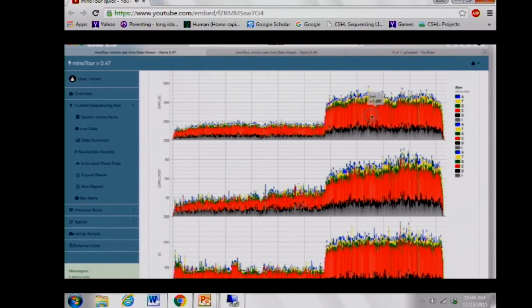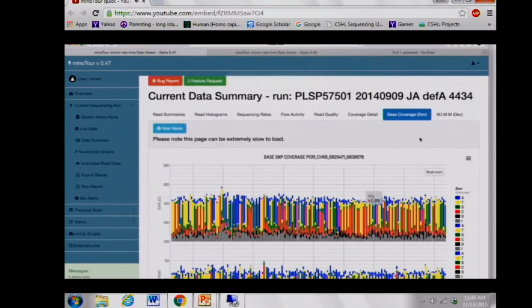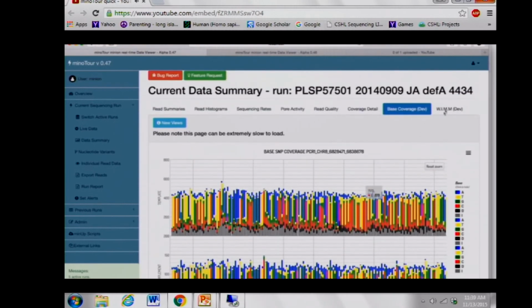I'm just going to zoom in on a tiny fraction of this so we can see it in a little bit more detail. So here we are zoomed in. Now hopefully you can see that the colours correspond to bases. So blue is A, yellow is T, green is G and C is red. We then also count deletions and insertions at each position. So you can view exactly what's happening, and we'll come back to this plot in a moment. This is under development. We're looking at it in more detail as we go through.